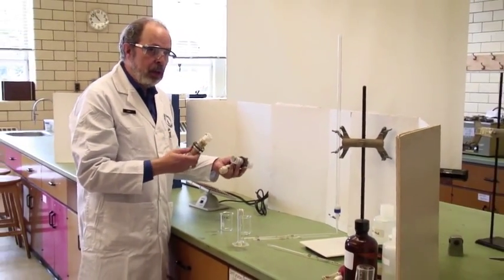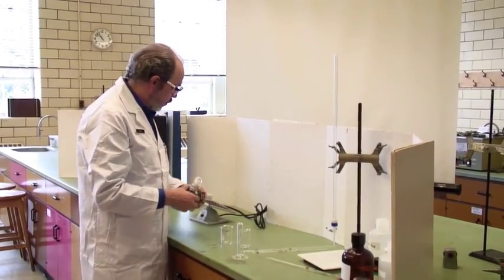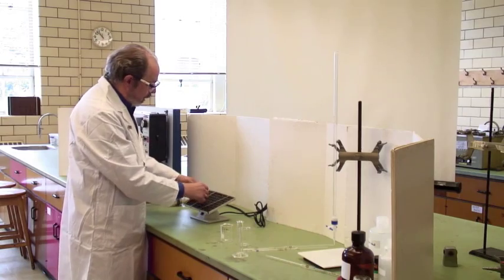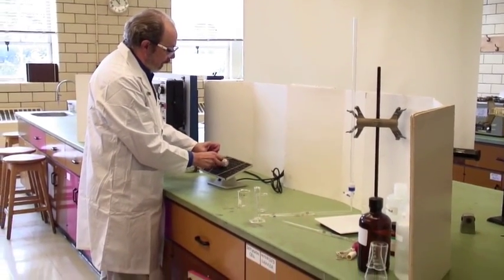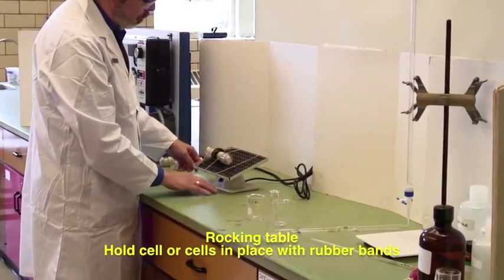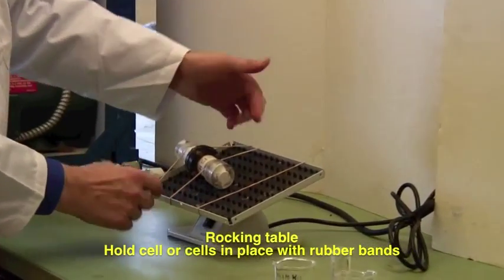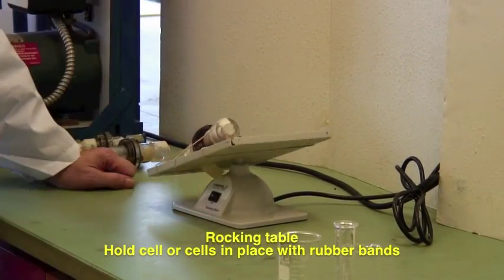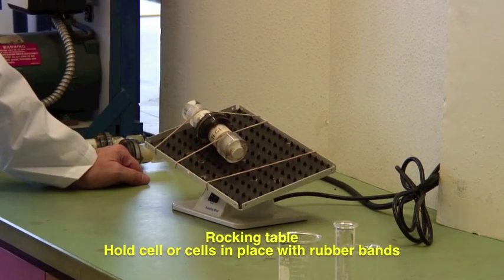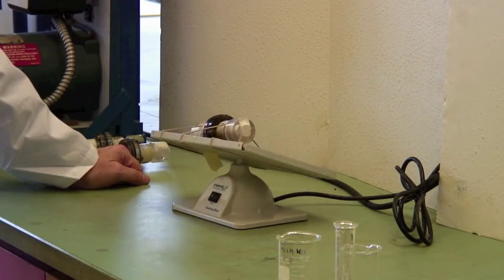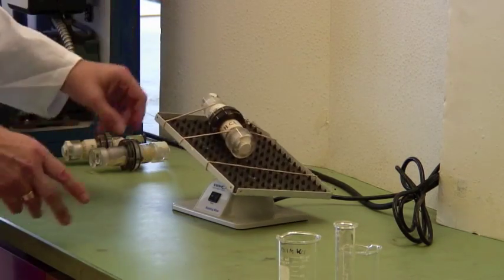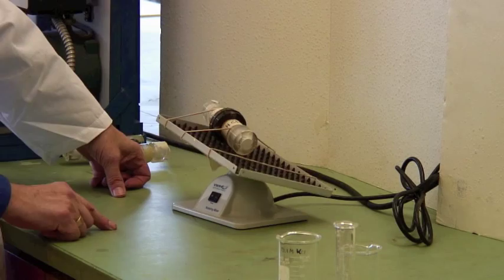And we've got multiple ways for them to be agitated. The first and the easiest one is this little rocking table. It's designed for blood labs. You need to hold it in place just by using the elastics, and push the switch. And that rocking motion is enough to make sure that you've got uniform concentration gradients inside the cells themselves.